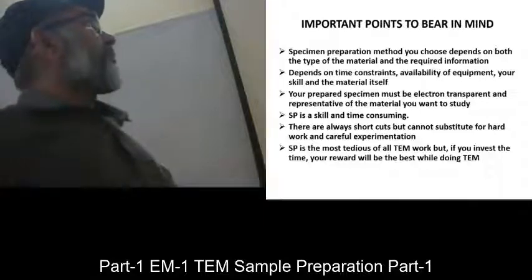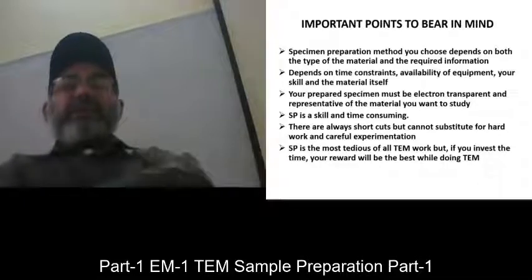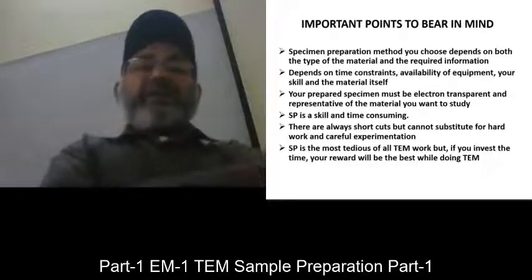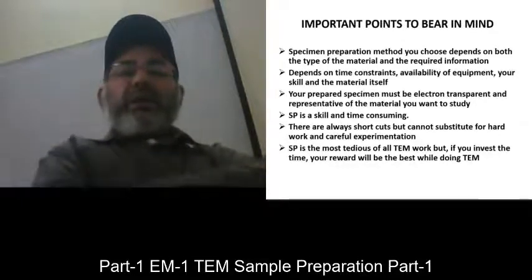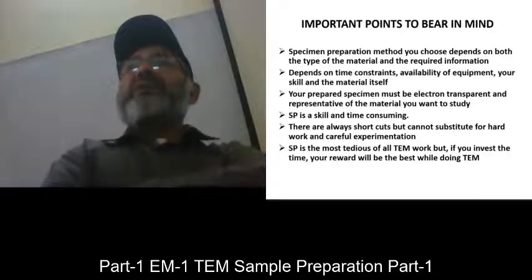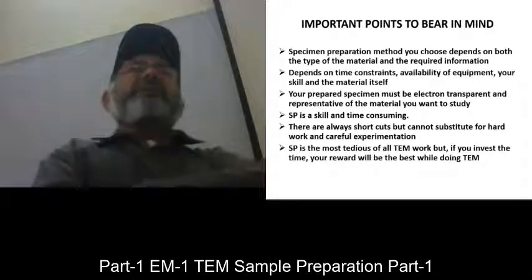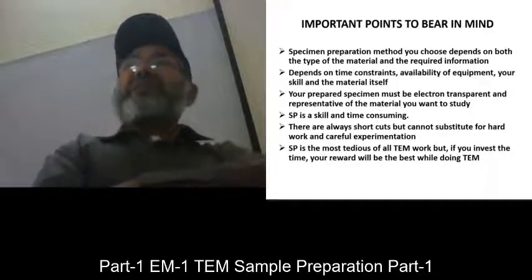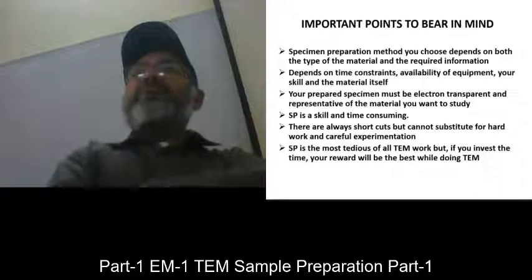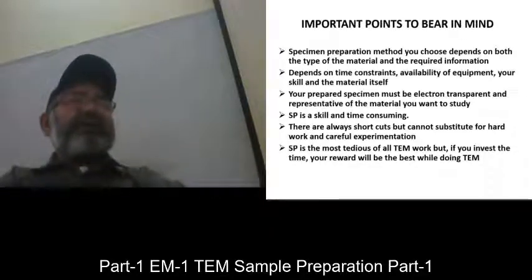Important points to bear in mind are that the specimen preparation method you choose depends both on the type of the material and the required information. What sort of information do you need? Obviously, the information you need is crystallography. You will be doing imaging as well as diffraction pattern.